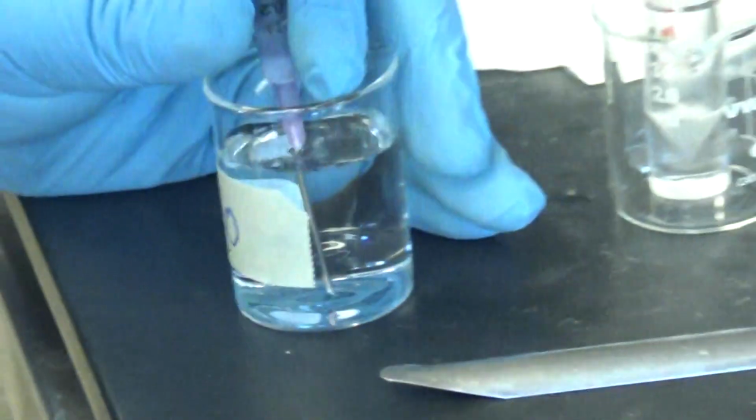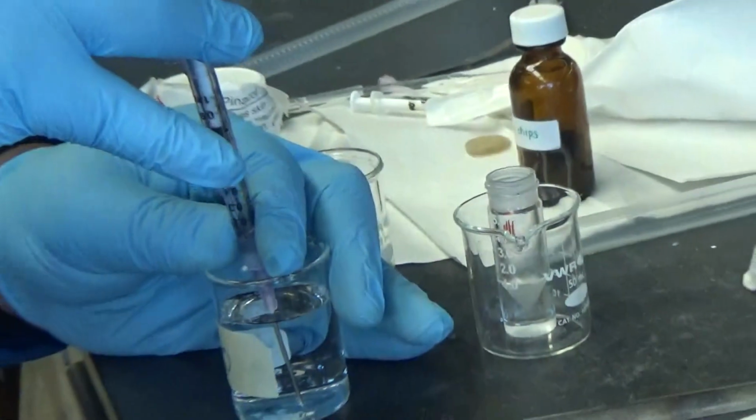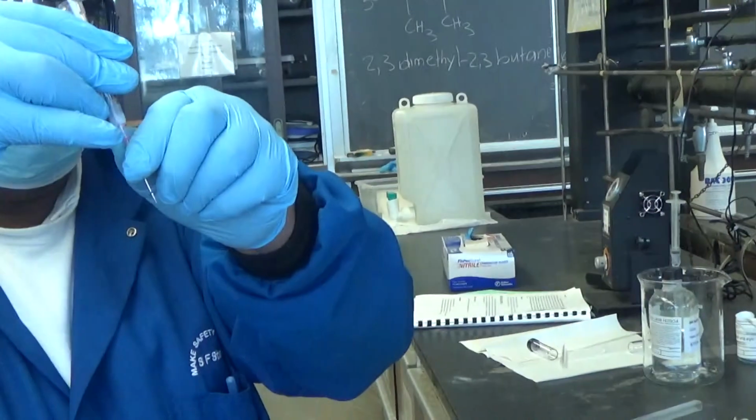So now you are going to add 1 milliliter here. I prepared that. So now you just have an organic layer, because you sucked up the bottom, which is water. I need to wash that again with water. I use a small syringe, and I add that here. Nothing will come out. This syringe doesn't seem to be good. Is it working? I don't see any water in there.